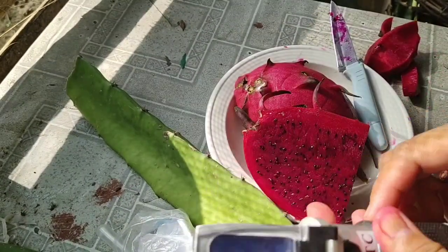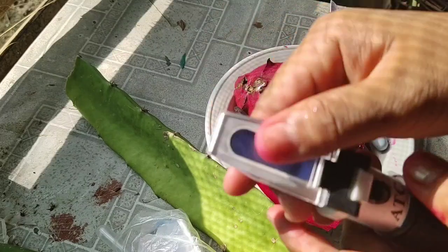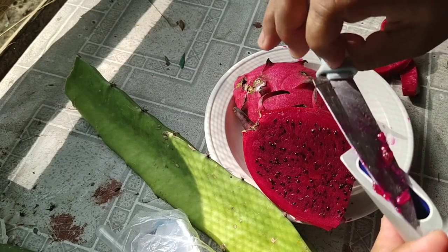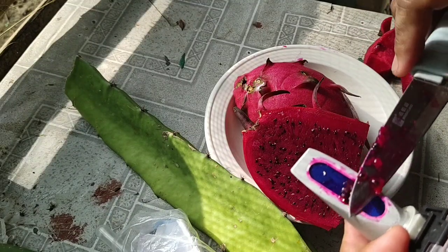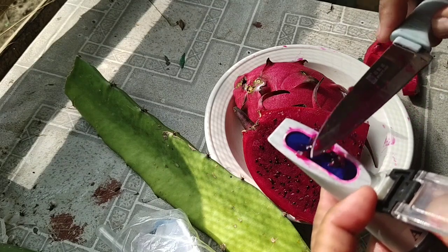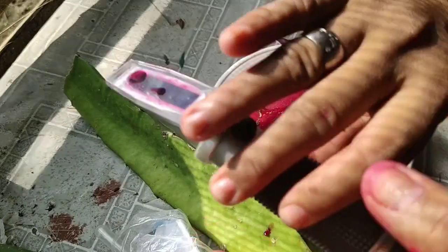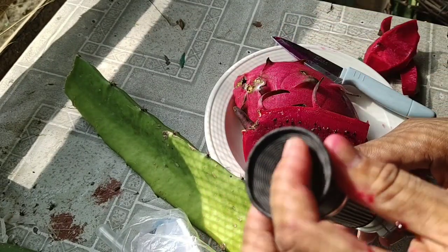I have with me my refractometer — we'll do a Brix test. Here's how I do it: I'll just take some of the fruit and spread it on the lens, like you're spreading some spread on your bread. Okay, I think that's enough, and then I'll look through the lens in here.